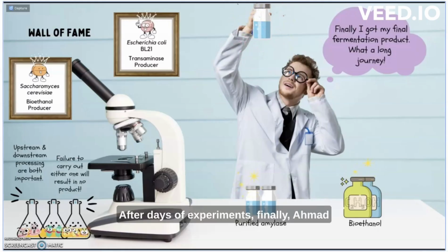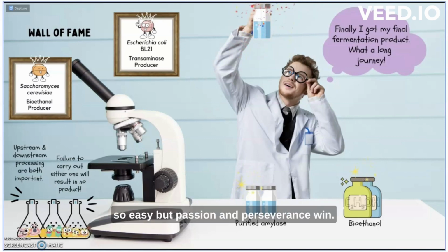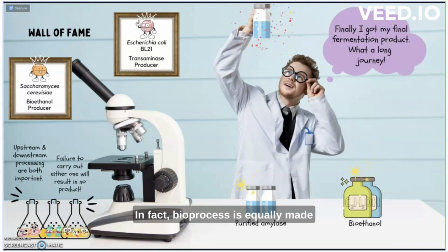After days of experiments, finally Ahmed has successfully recovered his fermentation products. Woo! Oh, what a journey! Well, nothing in the lab is so easy, but passion and perseverance win. Now he realizes that downstream processing is as complex and important as the fermentation process, because failure to carry out either one will result in no product. In fact, bioprocess is equally made of both upstream and downstream processing.